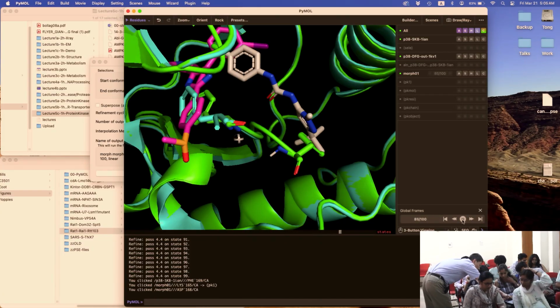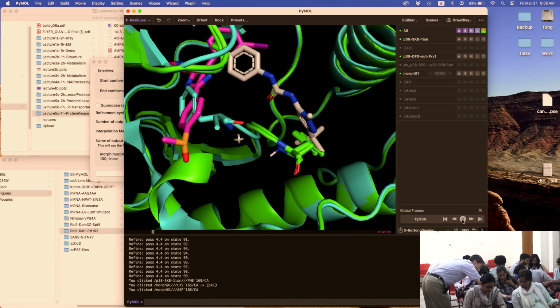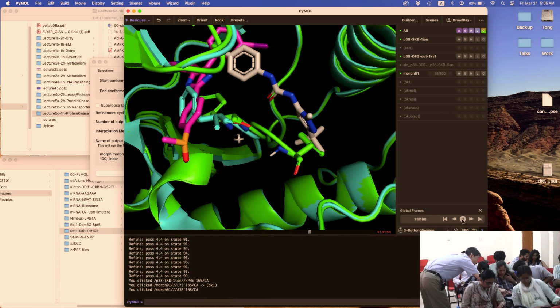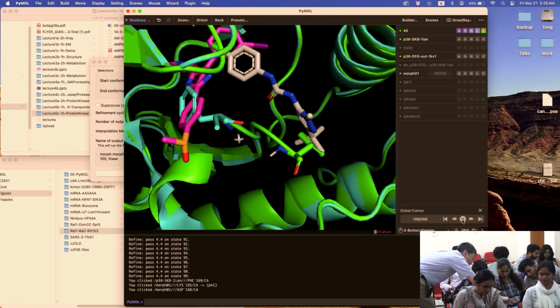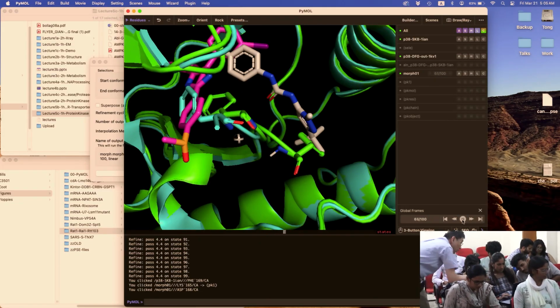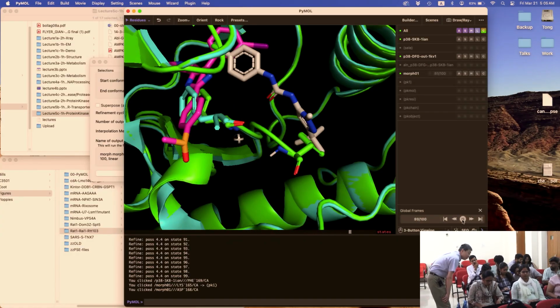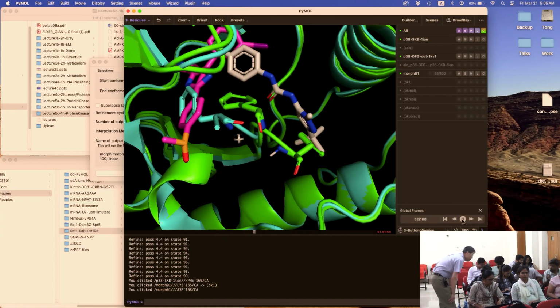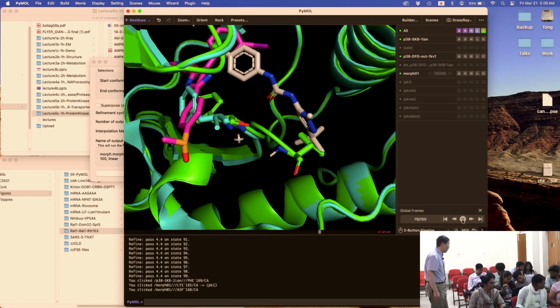So click on Seq. Yeah, SEQ. And then up here, you can go to phenylalanine. What number is it? I forgot the number now. DFG. Do you remember what number it is? Oops, my apologies.